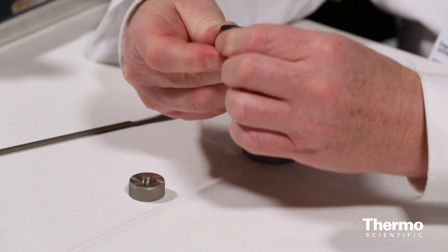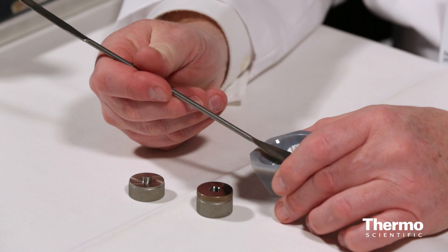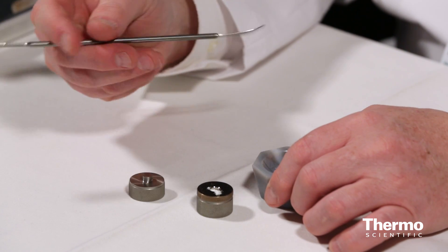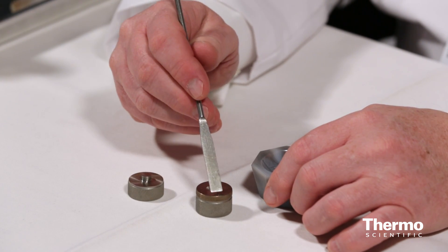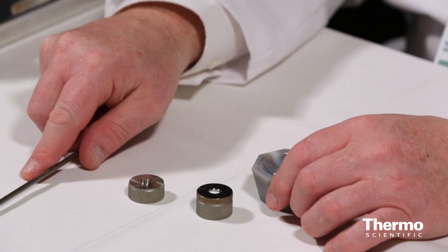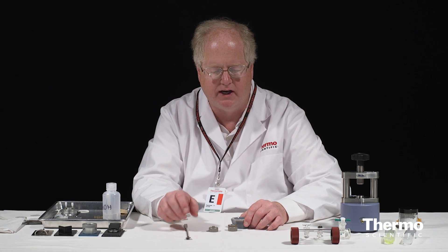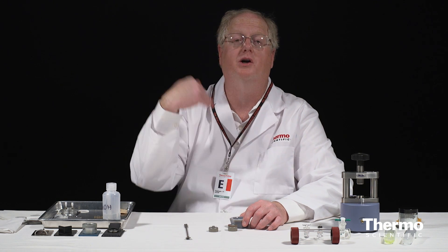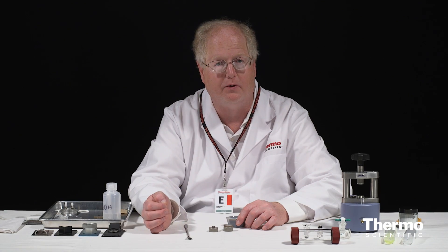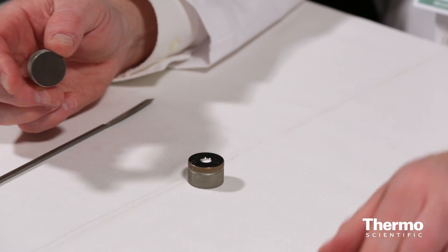So I put the small ring back on, and you notice that leaves me with a cup here. I'm now going to take my powder and insert some. One of the first mistakes people make when making these pellets is using way too much powder. If you use too much, your crystal is going to come out way too thick, and then the L factor in Beer's Law — epsilon L C — is going to be too big and your absorption is going to go off scale. You're not going to be able to see it. So I just have a little thin layer of the powder on the bottom.